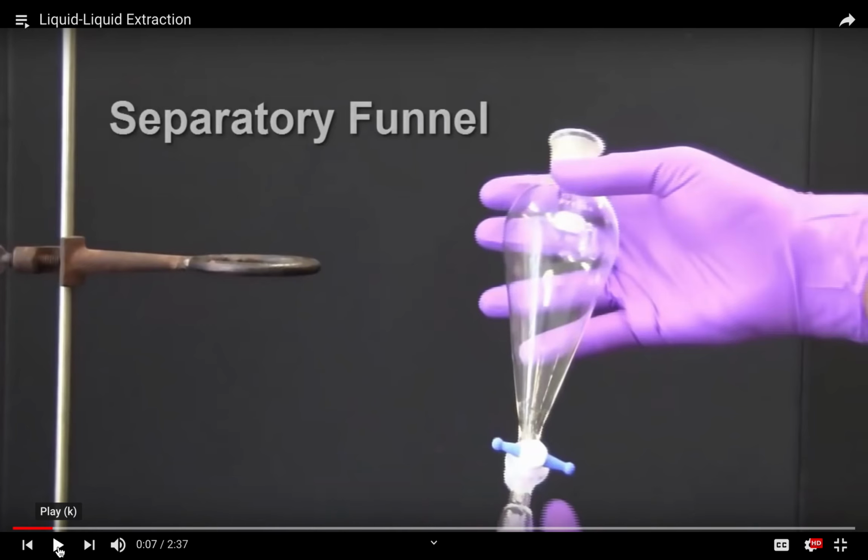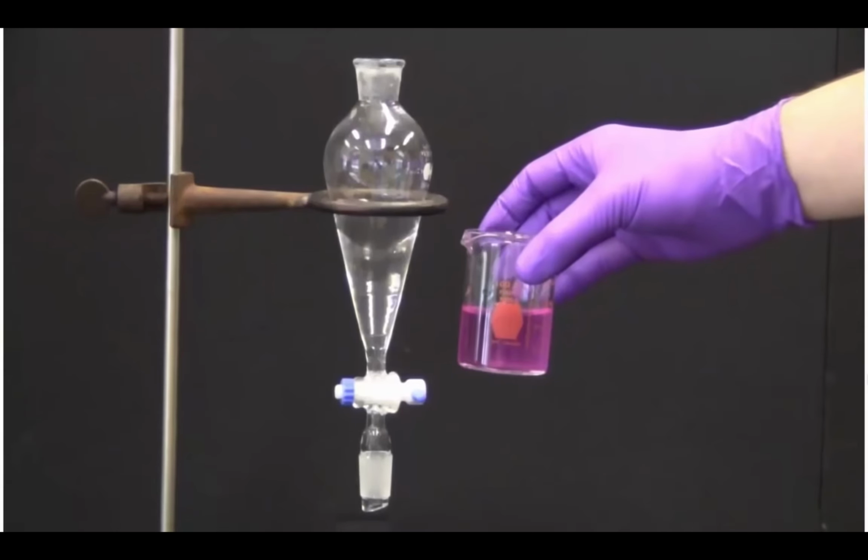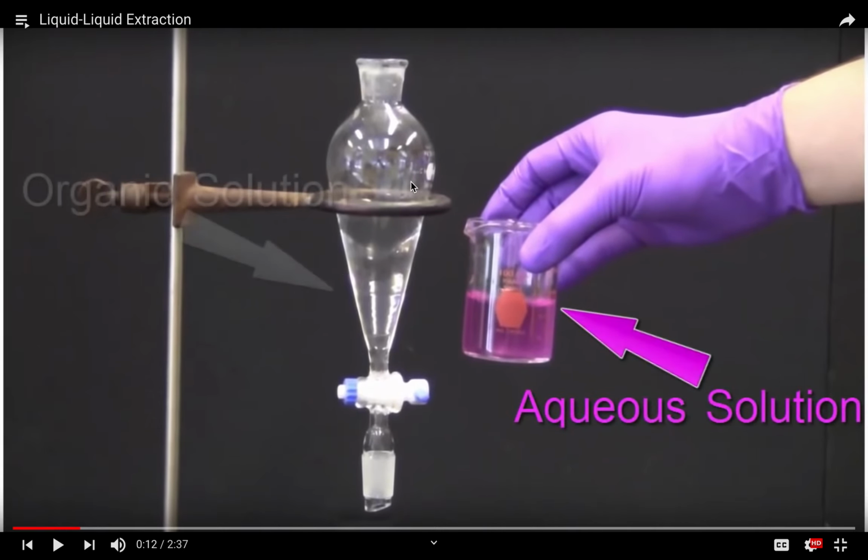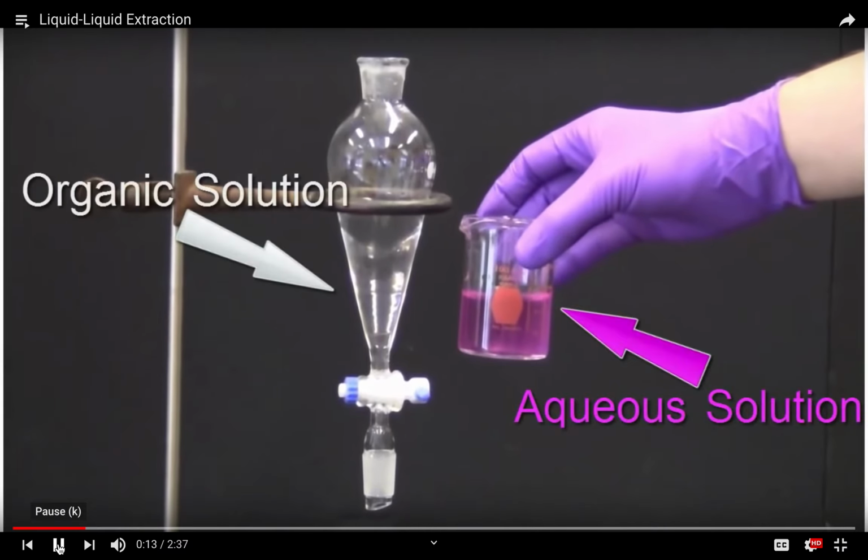I will show a video on how to use a separatory funnel. Here is a separatory funnel. A separatory funnel consists of a glass part and a plastic stopcock part to open and close the opening at the bottom. When you place your separatory funnel, you have to place it on this metal ring to stabilize it. Then you add your aqueous solution and organic solution.